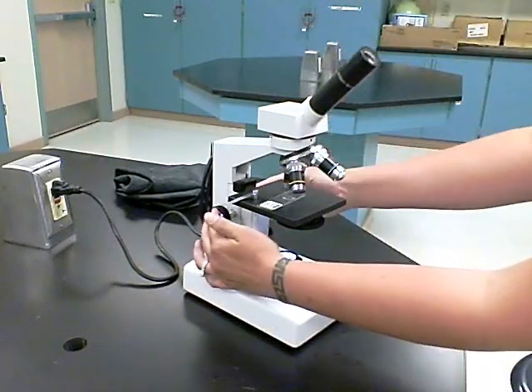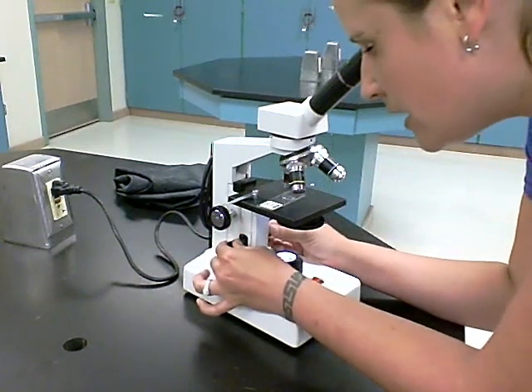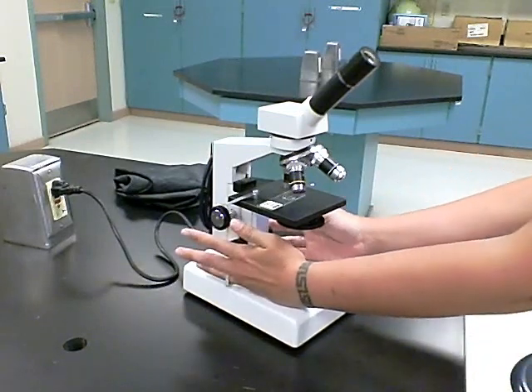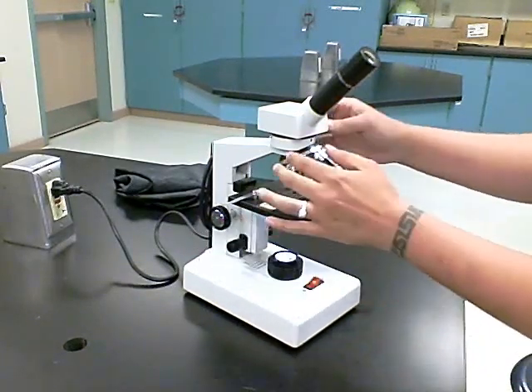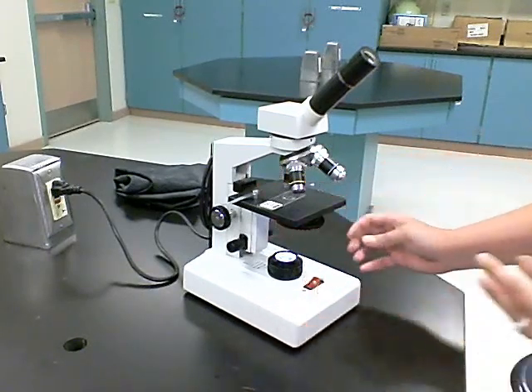Now, once it is in focus using that coarse adjustment, you can use the fine focus to finely focus in and out on the specimen. And you should never have to use this coarse knob again, not even when you're increasing objectives. Once you use it the first time, you should never have to touch it again.